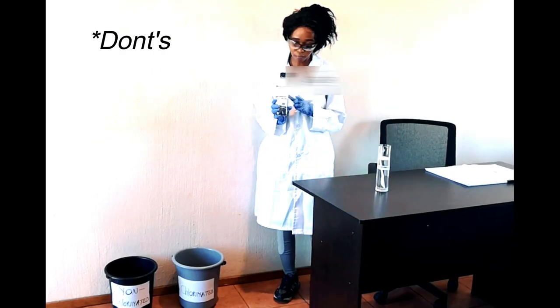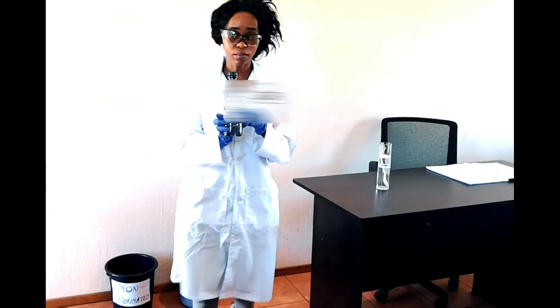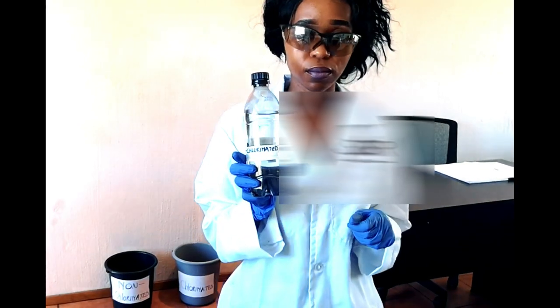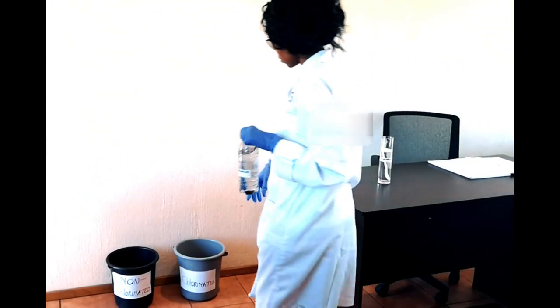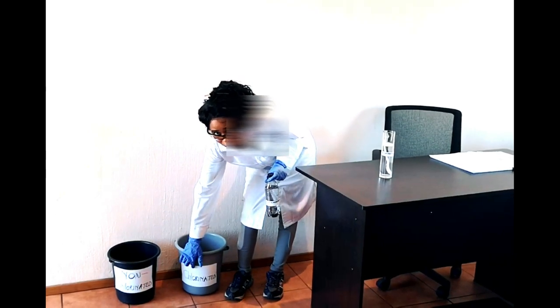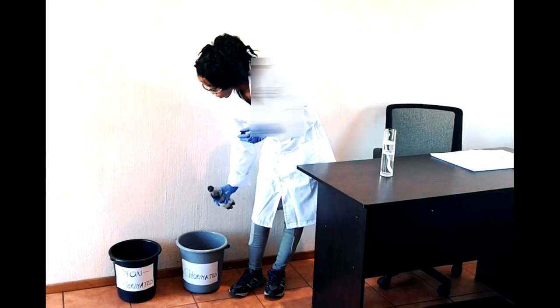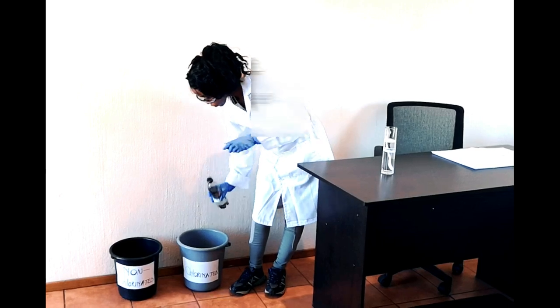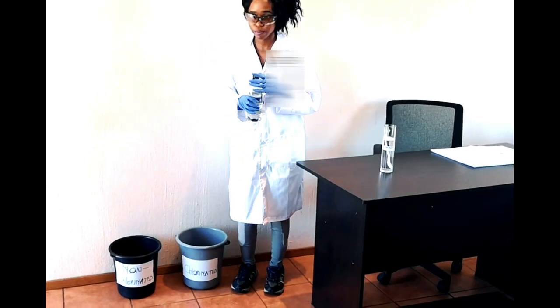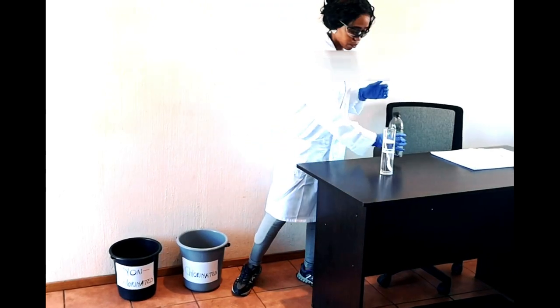Another mistake that people do is disposing of waste incorrectly. You'll see in the video I've got chlorinated and non-chlorinated waste, and I have chlorinated and non-chlorinated waste containers. In the first instance, which is the incorrect way of disposing, I dispose my non-chlorinated waste inside the chlorinated container, and then I take the chlorinated waste and pour it in the non-chlorinated waste container.